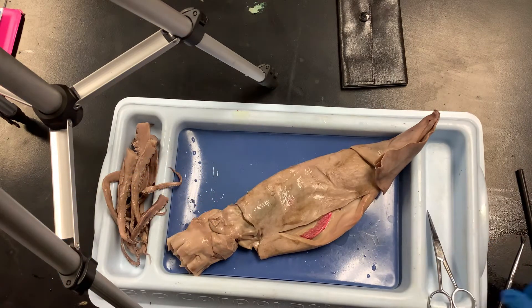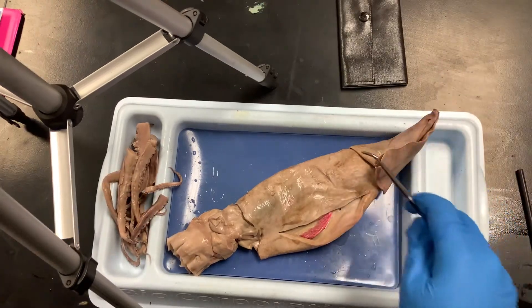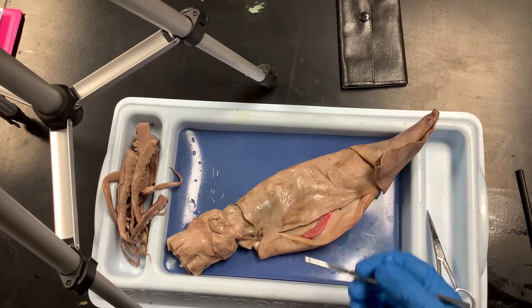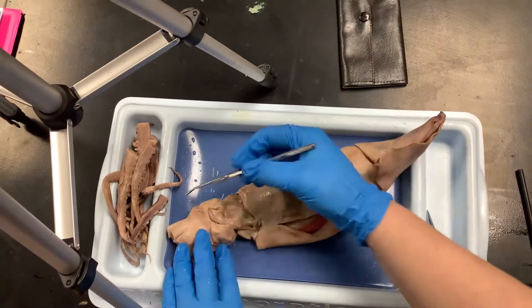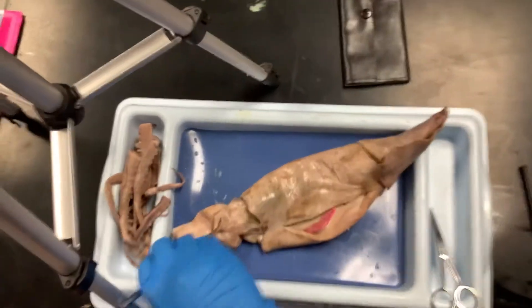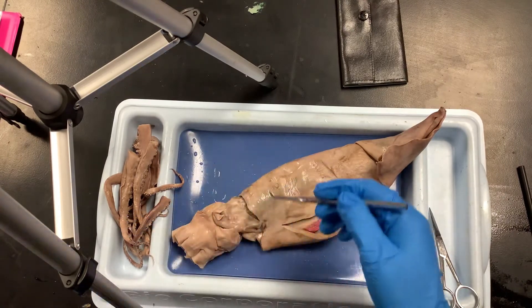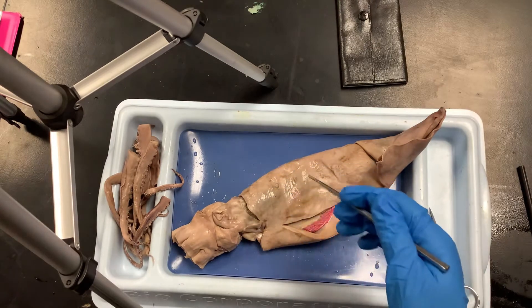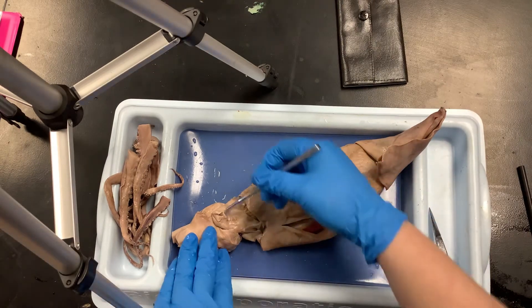Now that it sits a little bit easier on the tray, there are some other things we can look at. One is the actual siphon — it might be a little scrunched up, but it'll be at the side of the head. That is where the water shoots out and where the ink gland ejects from.